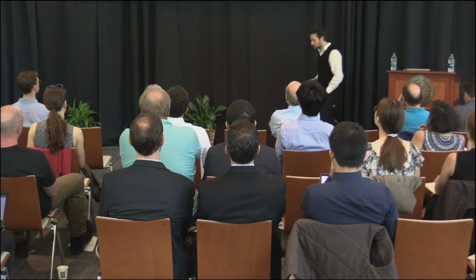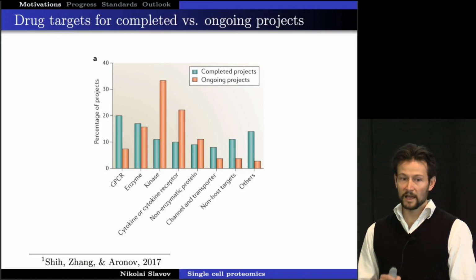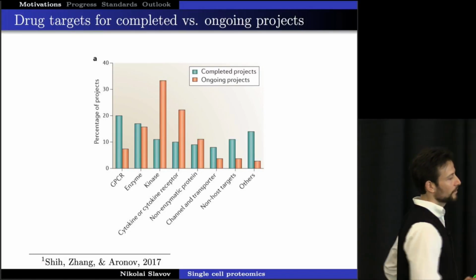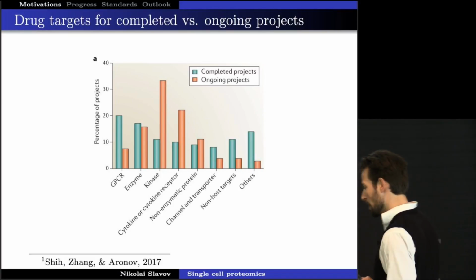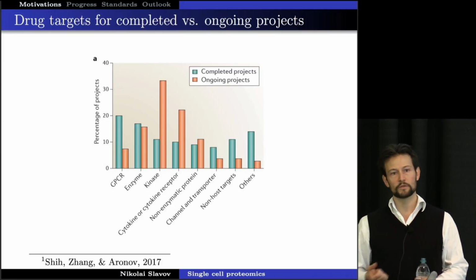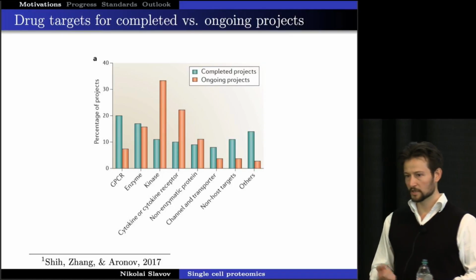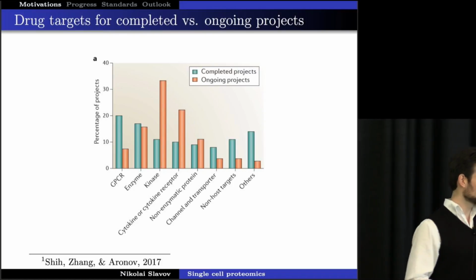Now, when it comes to post-translational modifications and signaling in single cells, mRNA data are even less informative. And that's important because currently, the largest number of ongoing efforts to develop pharmaceuticals is centered around targeting kinases. Similarly, efforts in my laboratory to improve rational differentiation protocols to make different cell types very much focus on trying to affect their signaling mechanisms, which we cannot very well infer from transcriptomics. And that's why we would like to measure not just the proteins, but also their post-translational modifications in single cells.